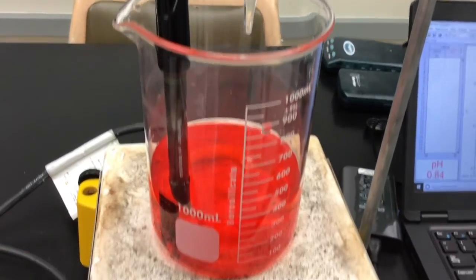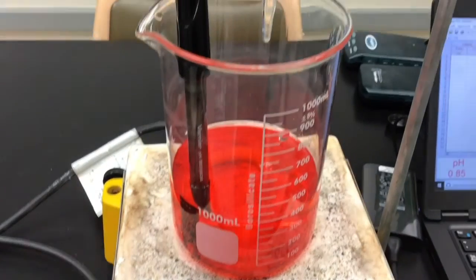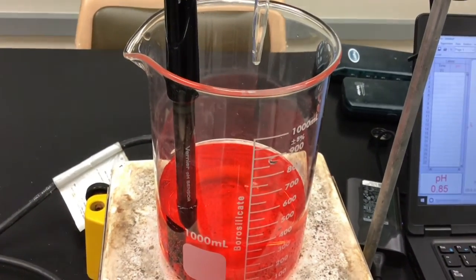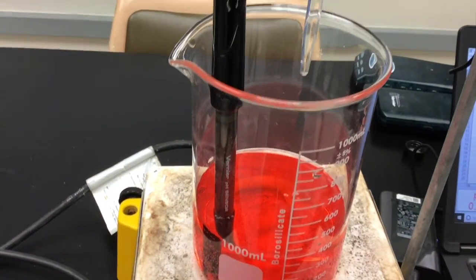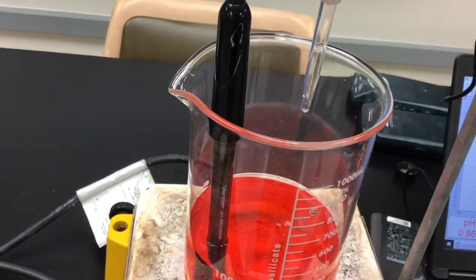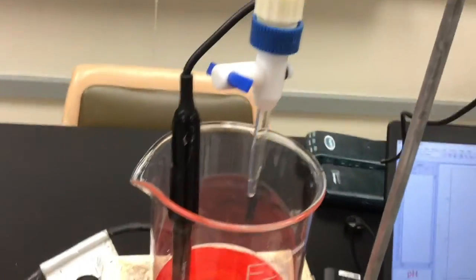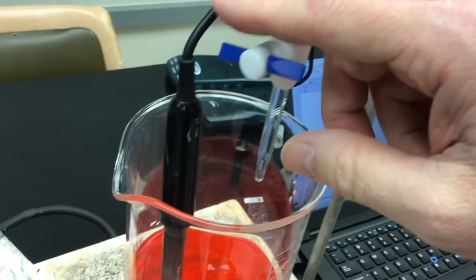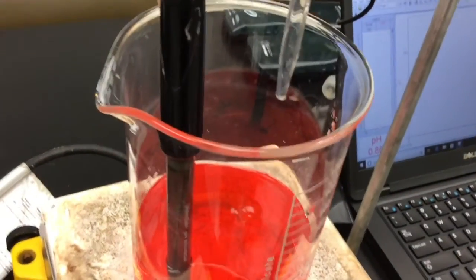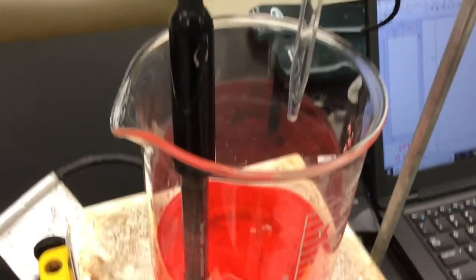So knowing that universal indicator is Roy G. Biv, red at about a 4, orange at about a 5, yellow at about a 6, green at about a 7, blue at about an 8, indigo at about a 9, and purple at about a 10, here's what I'm going to do. I'm going to open up this valve, my stopcock, and I'm going to put this in at a constant rate, drip, drip, drip. I'm not going to touch it.